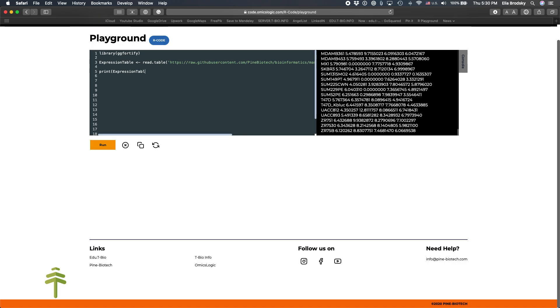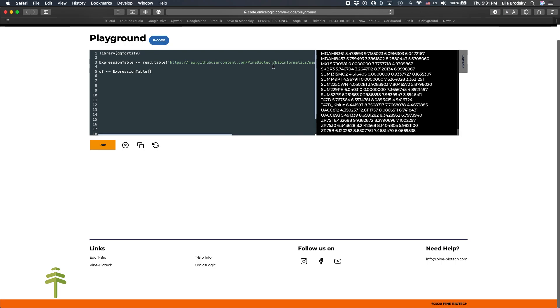Now that we know what's in our data, we can go ahead and run our PCA. So we'll create the data frame and that will be just rows 2 to 16. So this will be expression table. We already took the first row as the names, so we only have two. So that would be 2 to 16. And we can do PCA, or sorry, PCA will be PRComp. And here we'll add DF.